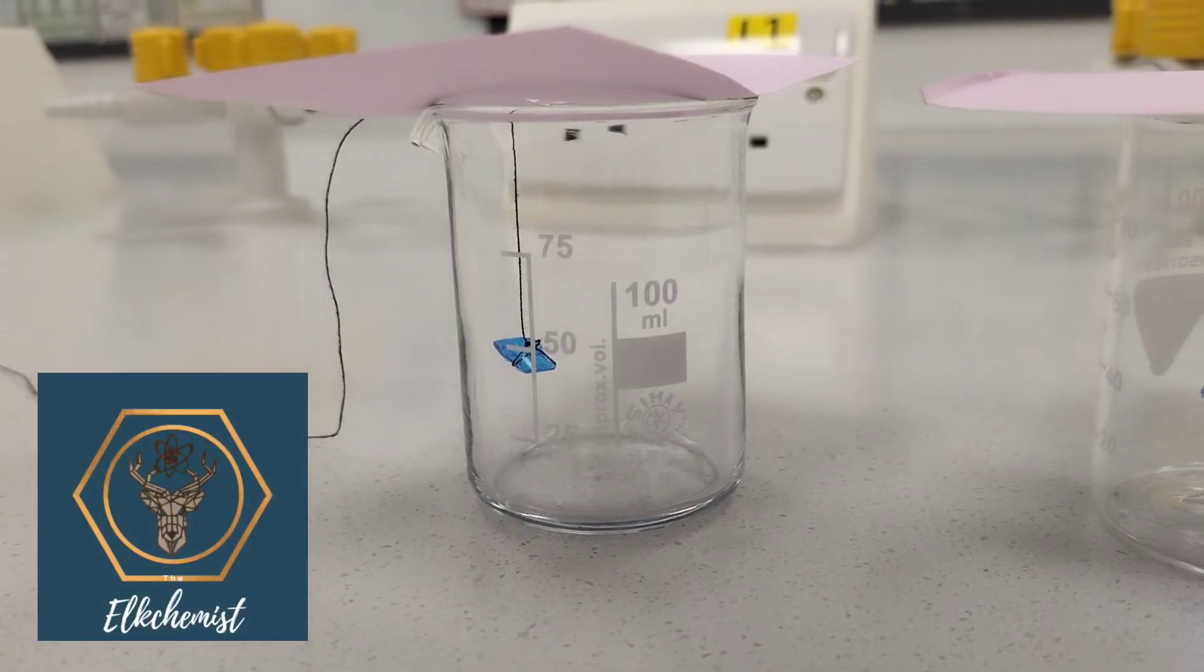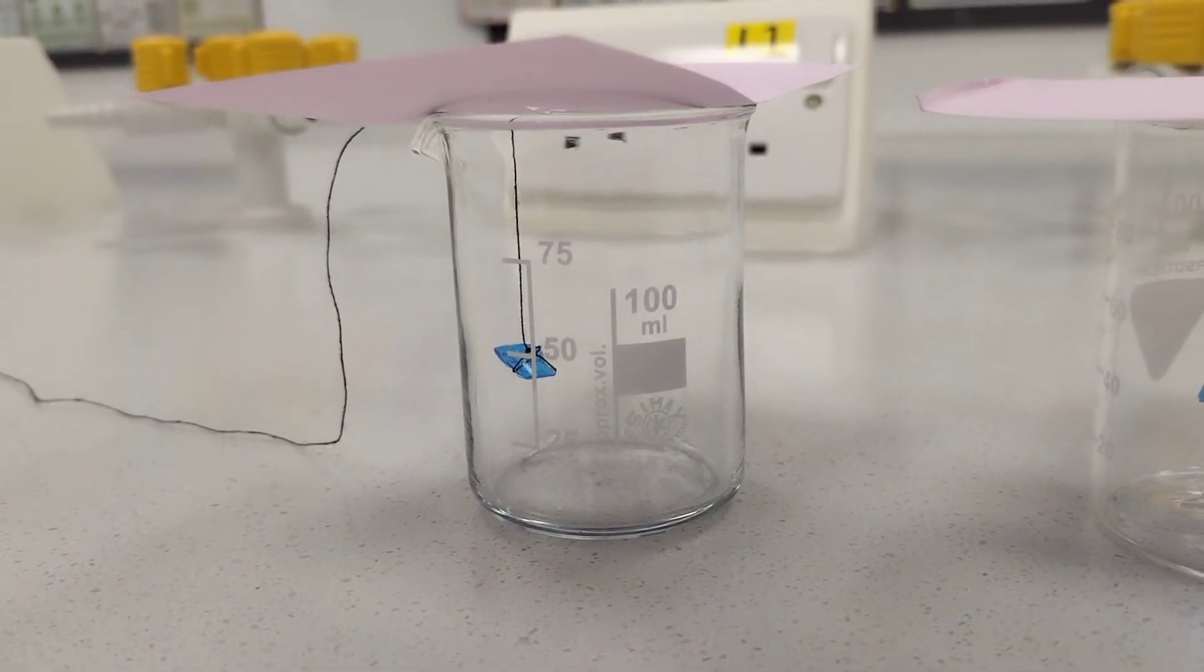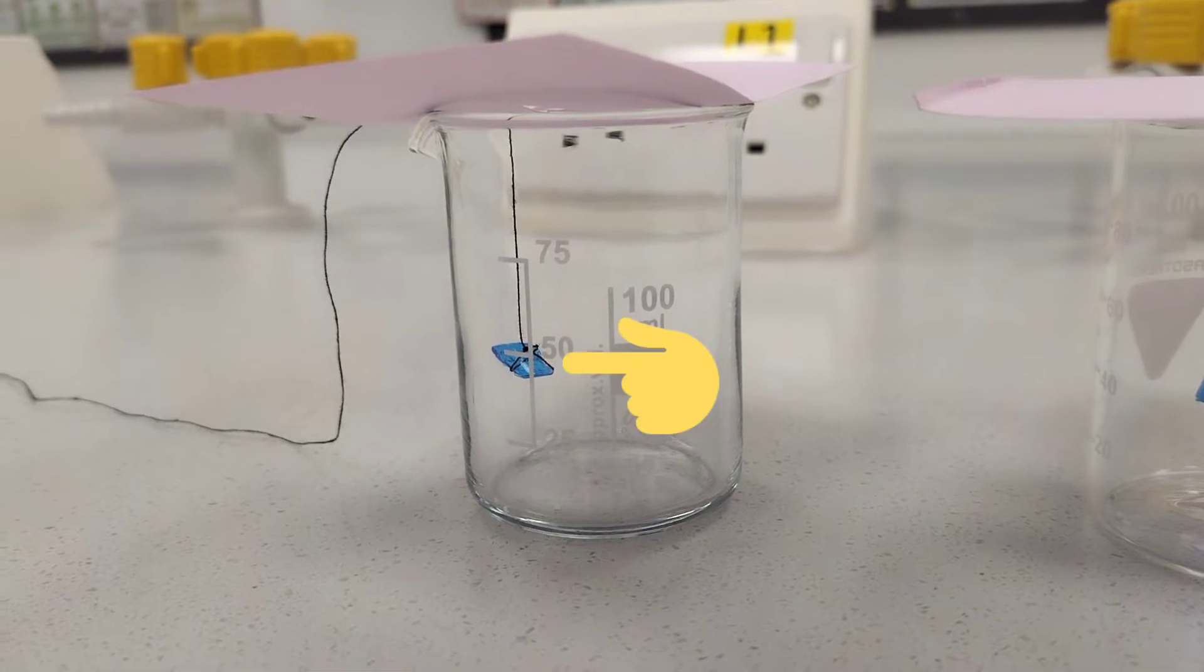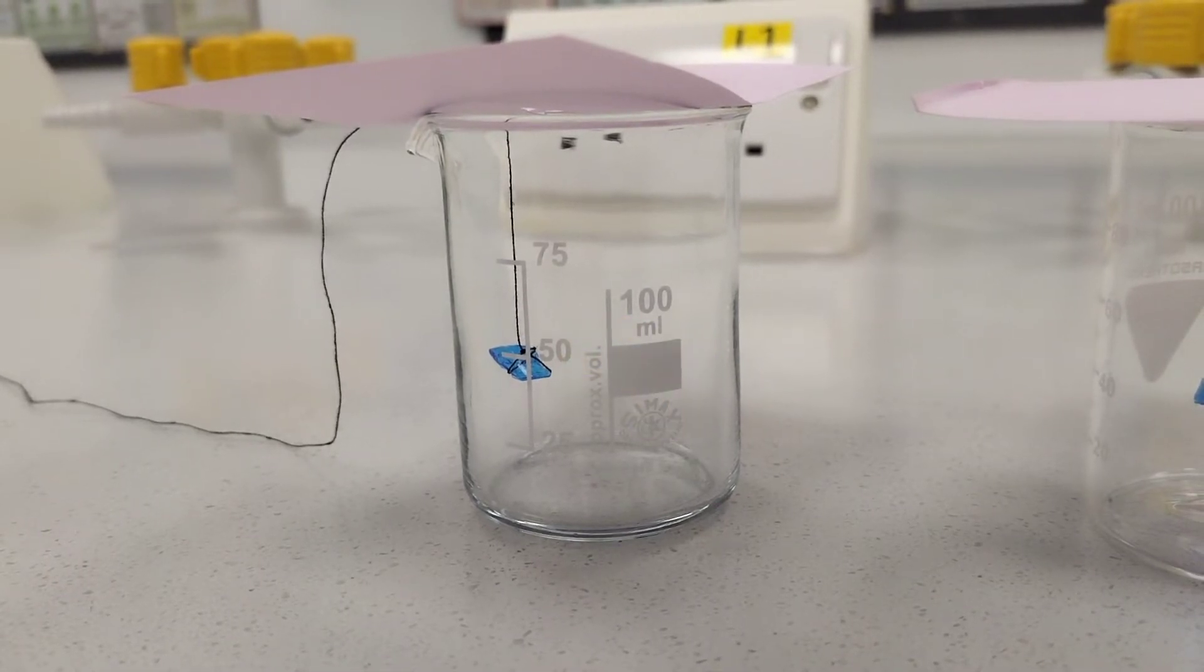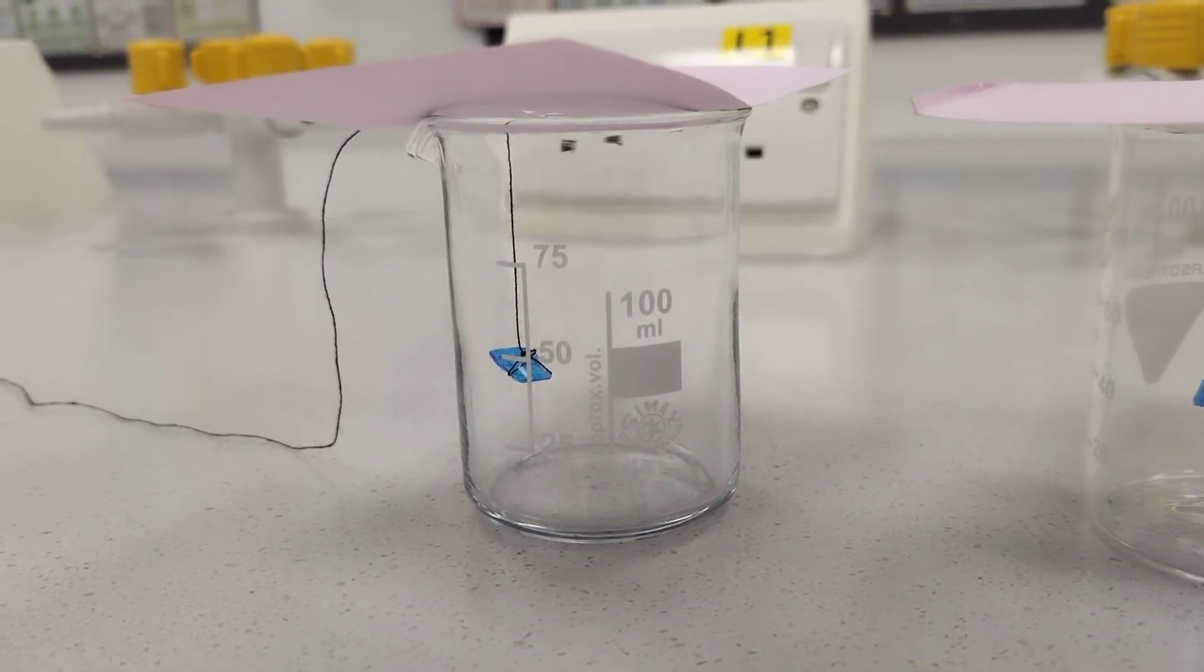Welcome to this Alchemist chemistry video. I'm going to show you how to grow a huge copper sulfate crystal. What I have here suspended in this beaker is a small seeding crystal which I'm going to use to grow my larger crystal from.